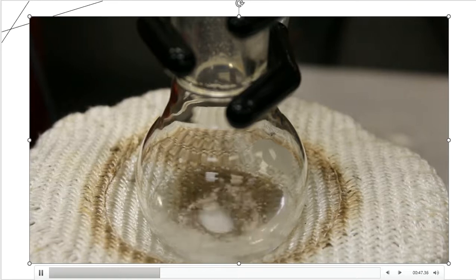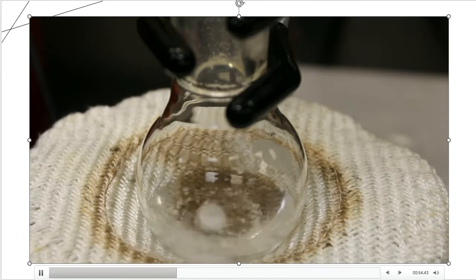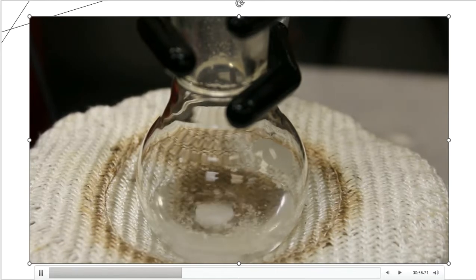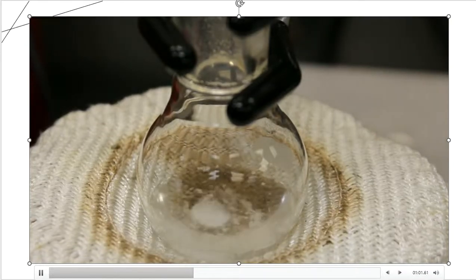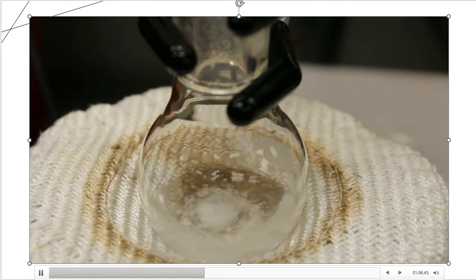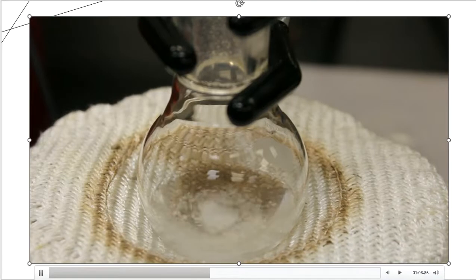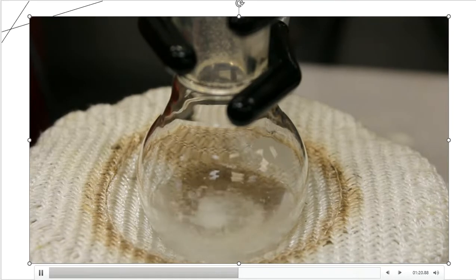So I'm just going to continue to add the aluminum chloride in small batches. I mean, that's what it tells me to do, right? So there was our first batch, and we'll continue to add that whole, it was almost 3 grams, into this compartment. You can make observations as you need. What you're seeing is probably a little bit of the aluminum chloride staying behind. It's not really fully dissolving quite yet. That's okay. It will. We're just getting it down into the jacuzzi tub with everything else.